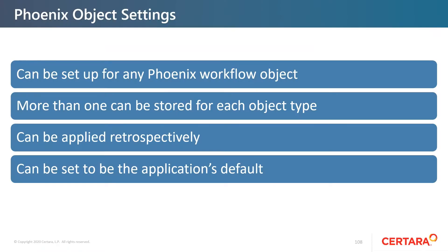In this short video about Phoenix object settings, I'd like to explain how they can be set up for any Phoenix workflow object. We'll demonstrate this using a plot object. More than one can be stored for each object type, so you can have a variety of these predefined template settings.